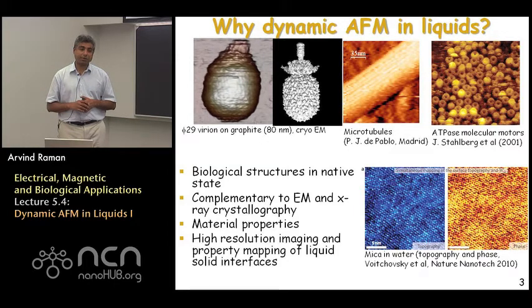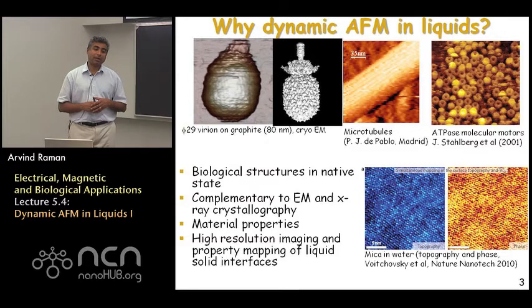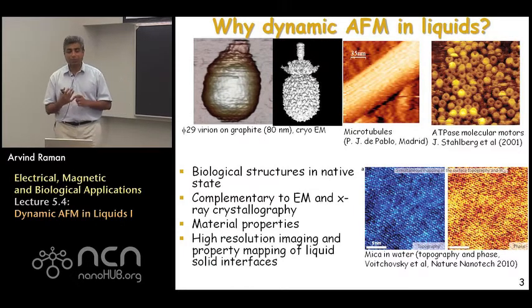So for example, on the bottom right, I'm showing you near atomic resolution images taken of freshly cleaved mica in buffer solutions. On one hand, you see the topography showing the lattice spacing of the atoms that make up the top surface of mica. On the right, you actually see phase contrast images, which in this particular paper have been used to come up with a map of local adhesion on the liquid-solid interface. So problems such as measuring properties such as adhesion or electrochemical properties or diffusion and dissociation of ions on liquid-solid interfaces, all these problems are a very important growth area when it comes to dealing with energy storage, battery-like interfaces, when dealing with wetting and desorption on surfaces. In this whole field, atomic force microscopy also plays a very important role by studying the properties of the liquid-solid interface itself.